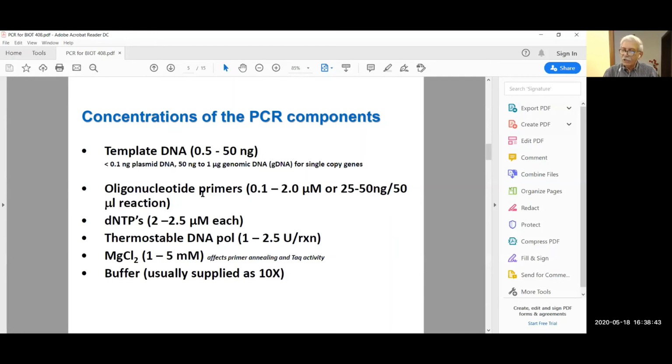Okay, so how much dilution do we need to make of our stock to use 1 microliter? 1 microliter from the stock has got 1000 nanograms. We want 25 nanogram per microliter. How much dilution will we make? Divide 1000 by 25, that is equal to 40.